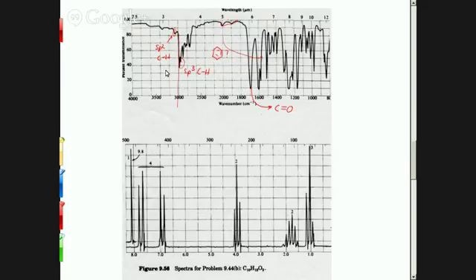Let's pull this table back up. I said between 6 and 8. So between 6 and 8, really the only thing that shows up there is right here. Oh, the IR chart. Yeah, no, we're looking at the NMR now.